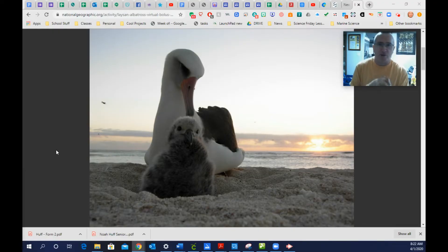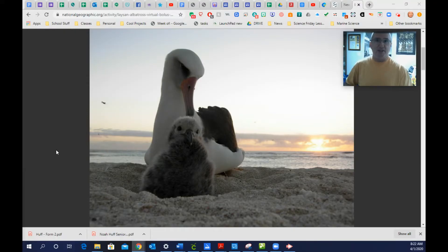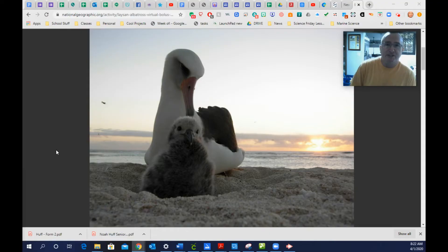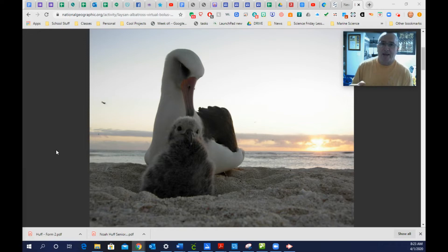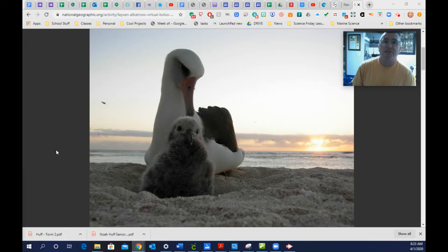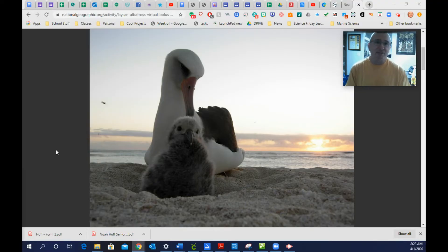They like to eat squid, flying fish eggs, small fish, crustaceans — things like that. They'll fly out, digest part of that food, and anything they can't digest they regurgitate through a bolus. Quite often this includes bones, shells, and the beaks of squids, one of their favorite foods. During nesting season they'll come back and regurgitate material they've eaten, including all the stuff they can't normally digest.